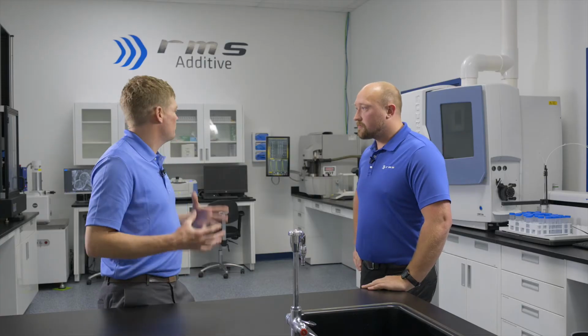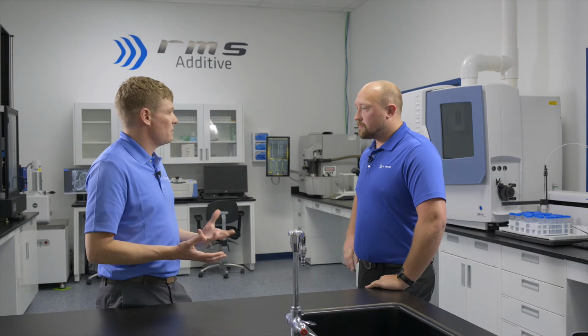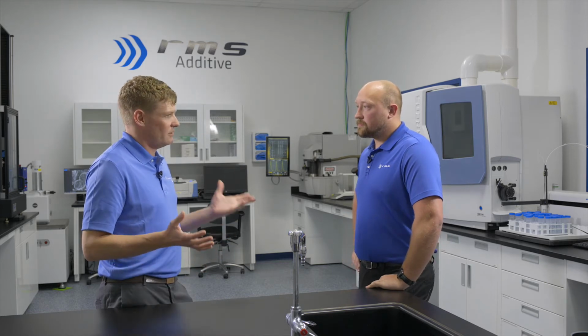And what do you use all those test methods for? Is there a specific standard that you try to certify material to? Yeah, so with the additive manufacturing builds, you need to test towards ASTM F3001, which requires chemical composition testing, mechanical testing, as well as microstructure testing. And ASTM F3001 is a specification for? It's specifically for additive manufacturing TI 6-4 materials.